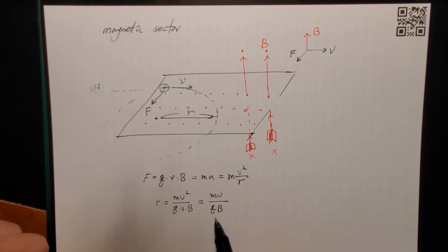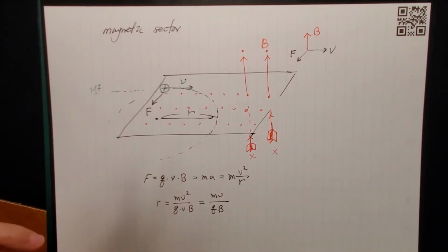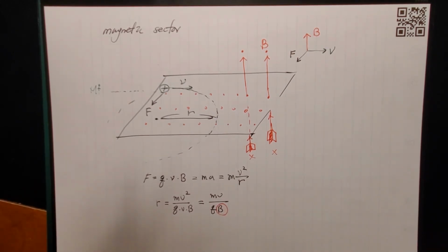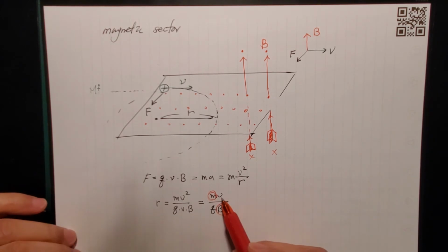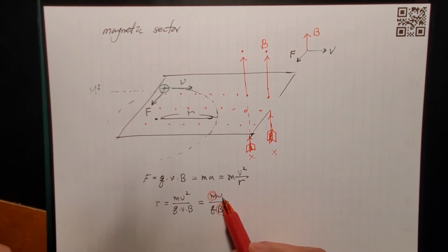Yeah, so after canceling the velocity, as you operate the spectrometry, you'll be constantly changing the magnetic field in order to select the mass. And how do we do that? Well, the velocity of the ions will be the same. It will be set up that way.